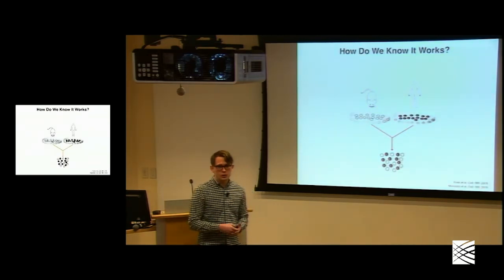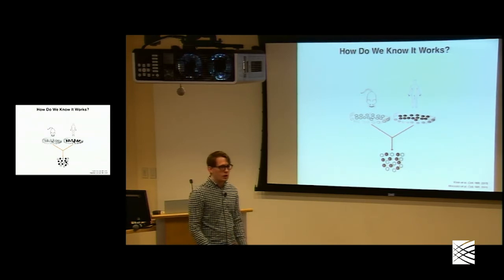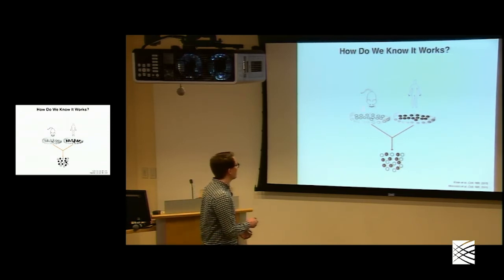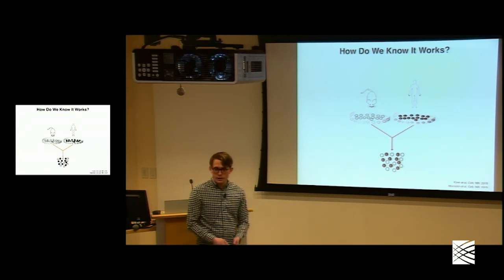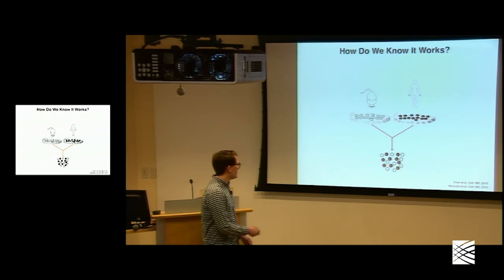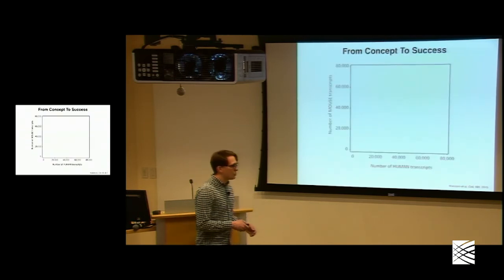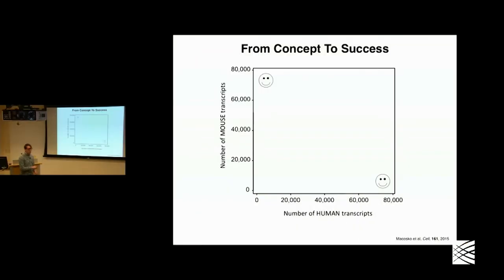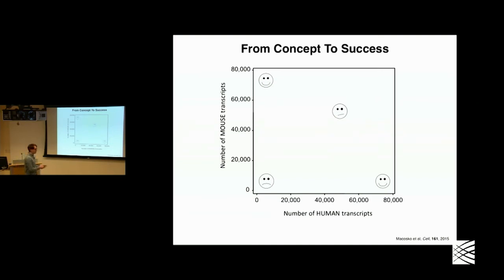So how do we know this actually works? We first did experiments very similar to many of you in the audience. We took mouse cells and human cells — NIH 3T3 and HEK 293s — mixed them together and applied them to the device. If we're doing well, we're out here on the axis, with all cells mapping to either the human or mouse transcriptomes, which gives us a sense of single-cell resolution. If we're here, we're less happy but at least capturing something. But if we're down here, we just sort of go back to the drawing board — we're not capturing anything at all.